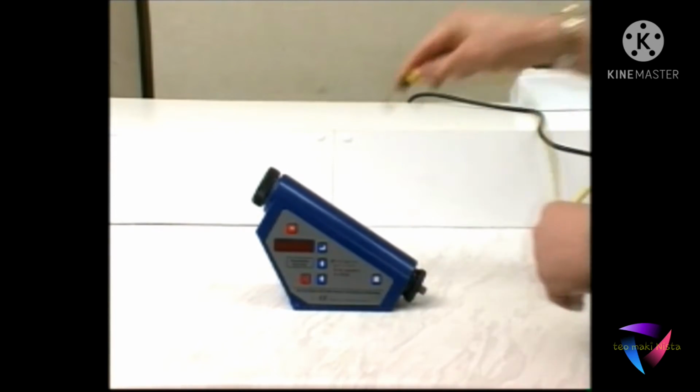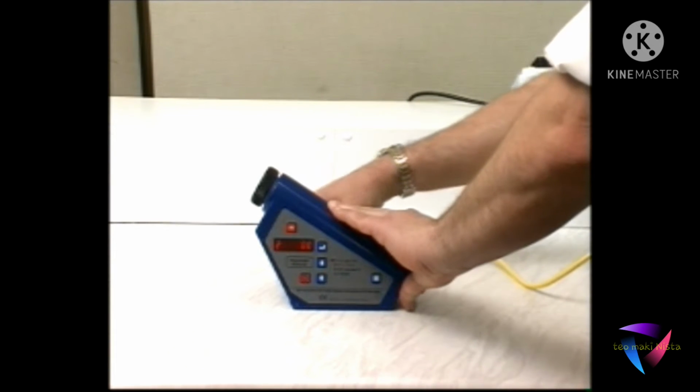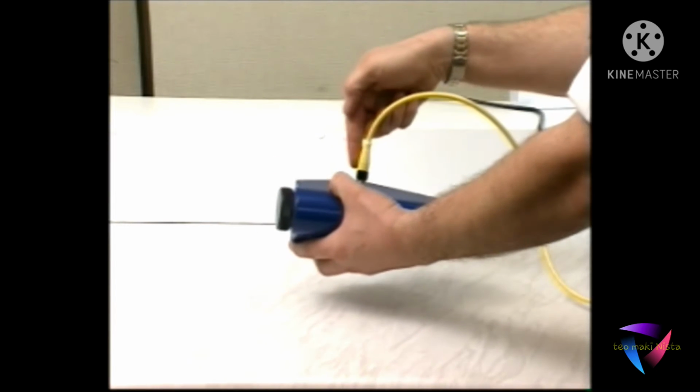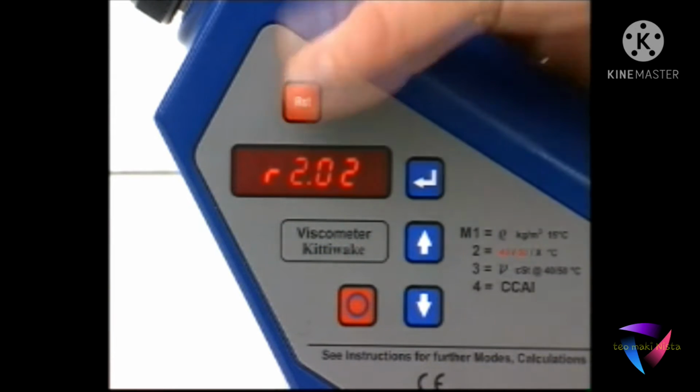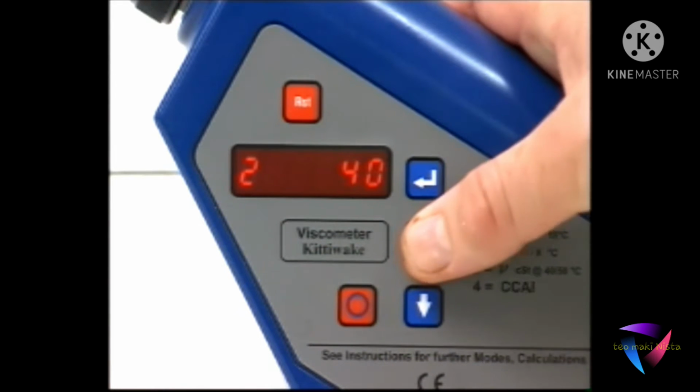Connect the power cable and the viscometer is ready for use. To take a measurement, start by pressing Reset. You can use the arrow keys to move between temperature settings.